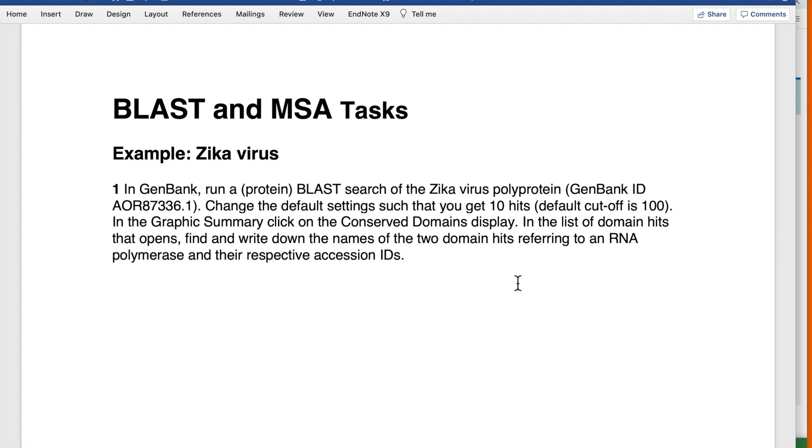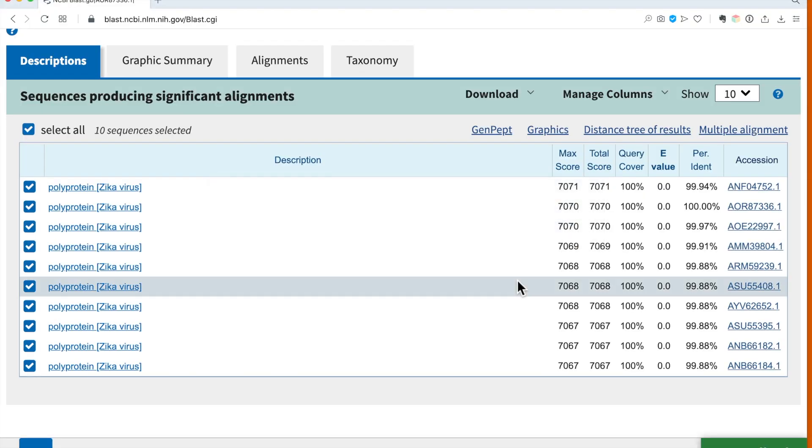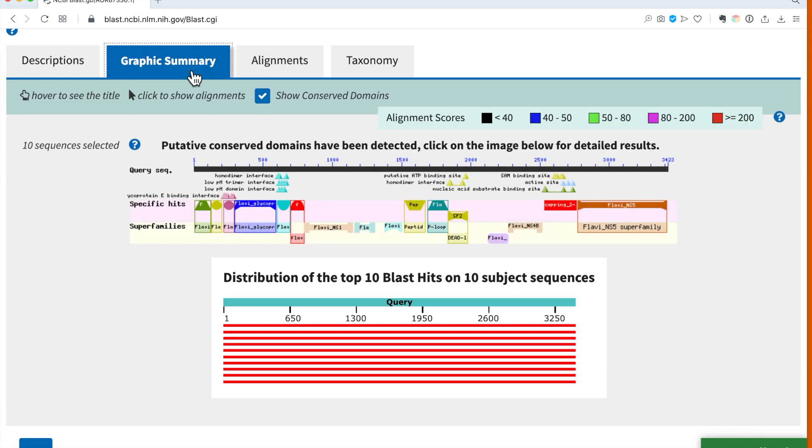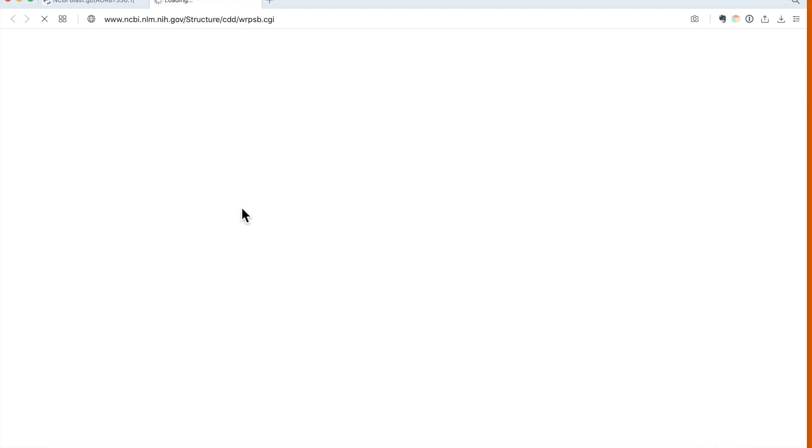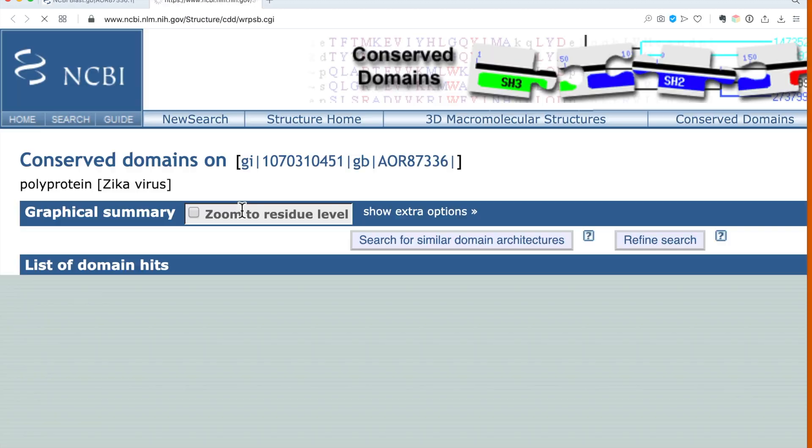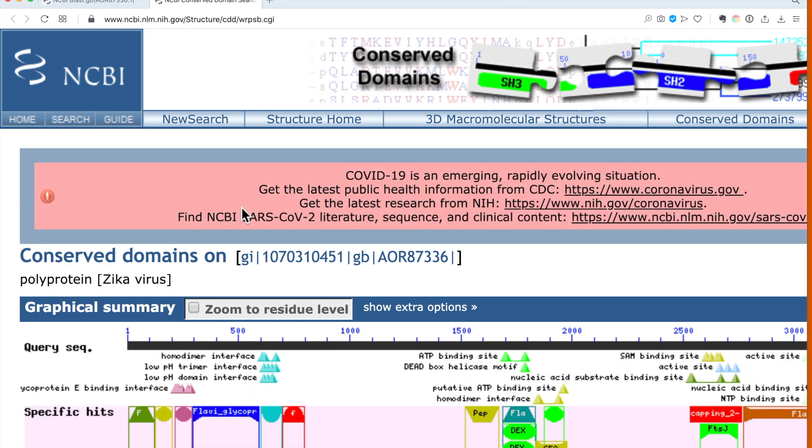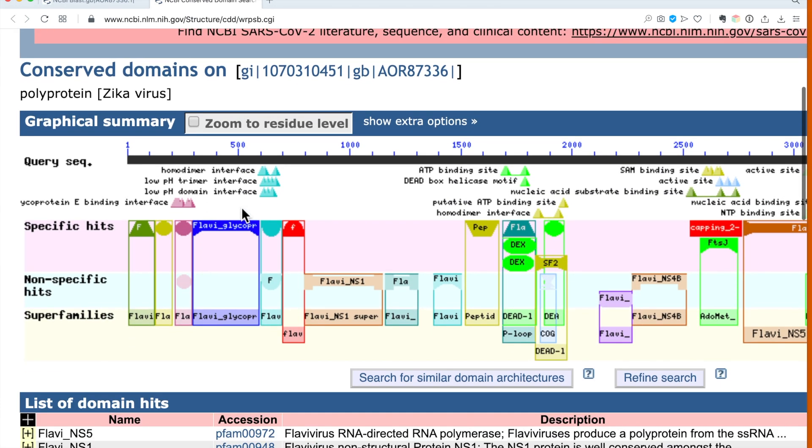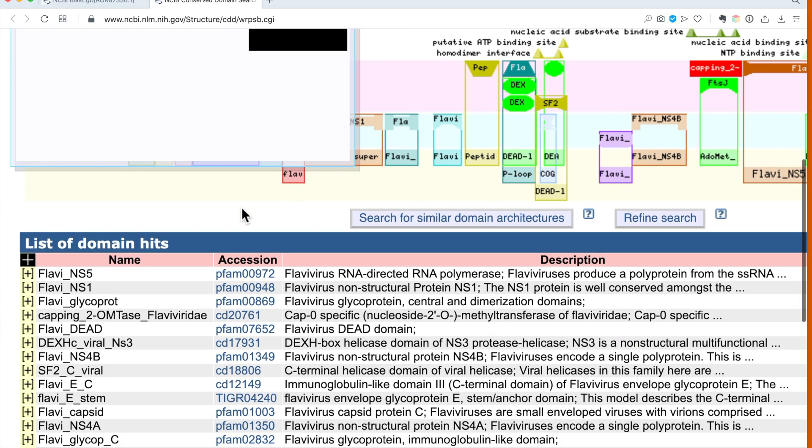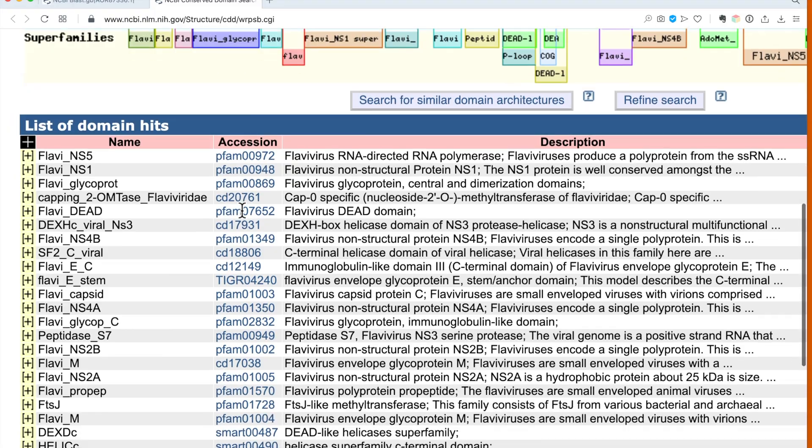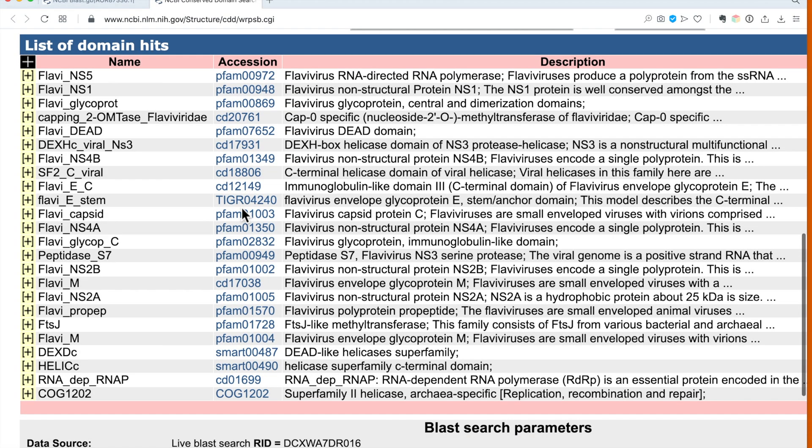We can see our descriptions here. The graphic summary is the second tab, and just giving it a click on the overview we can also get the conserved domains as a list. I'm just scrolling down to see the complete list of domain hits.